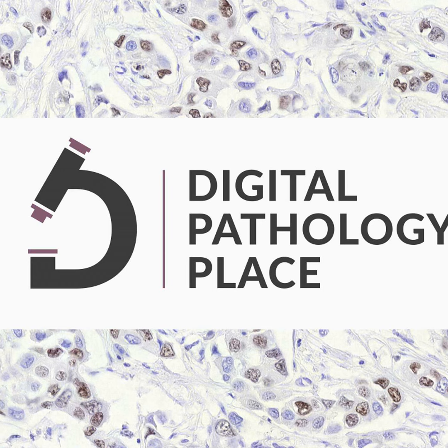What it is, basically, in its simplest form, the veterinarian or veterinary technician, the person in the clinic, is looking at the slide on their microscope in their clinic, and then they're taking photos with their smartphone or their microscope camera, but a lot of times it's with a smartphone. These smartphones are so powerful and their camera abilities are great. And so, if you're good at holding your phone to the ocular, then you can just do it that way. Or there are some cheap attachments or even some more robust ones.